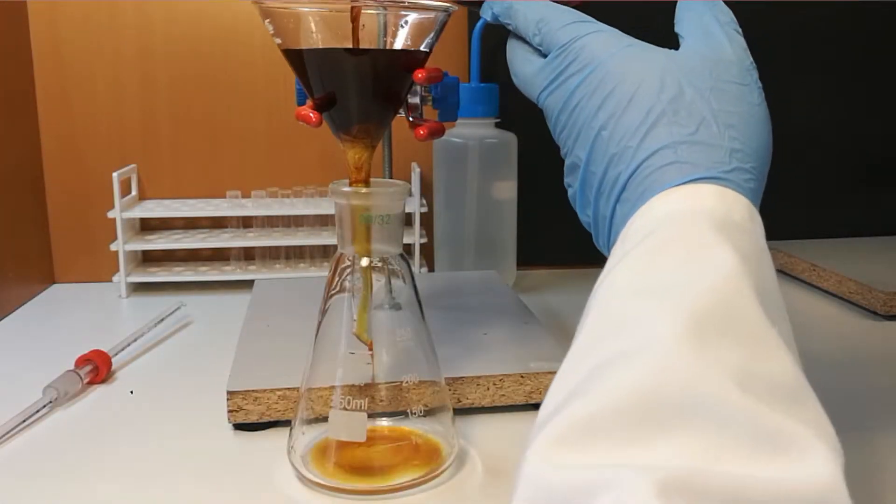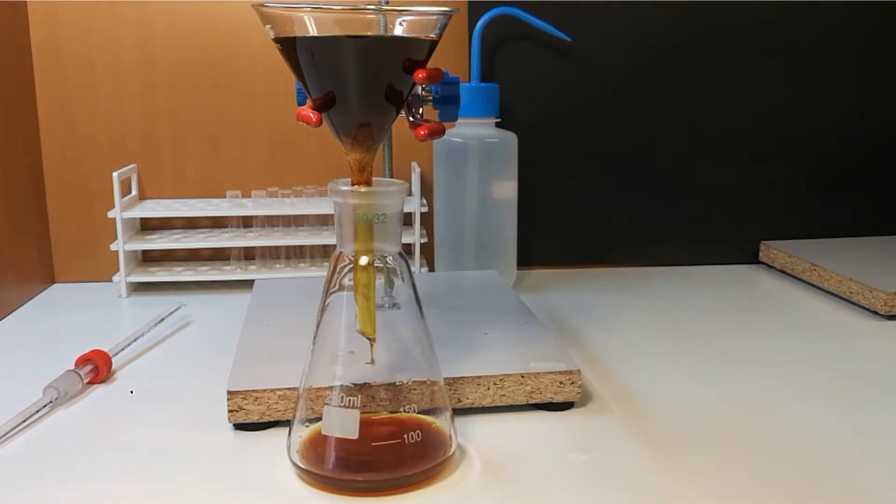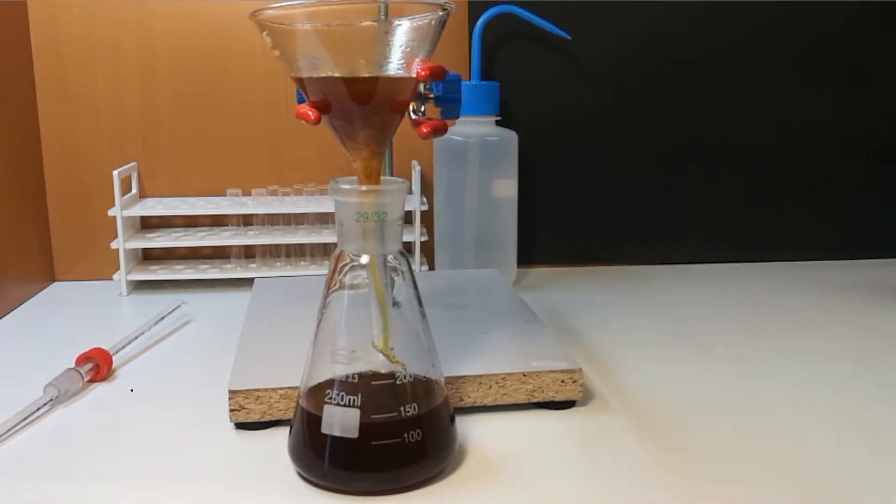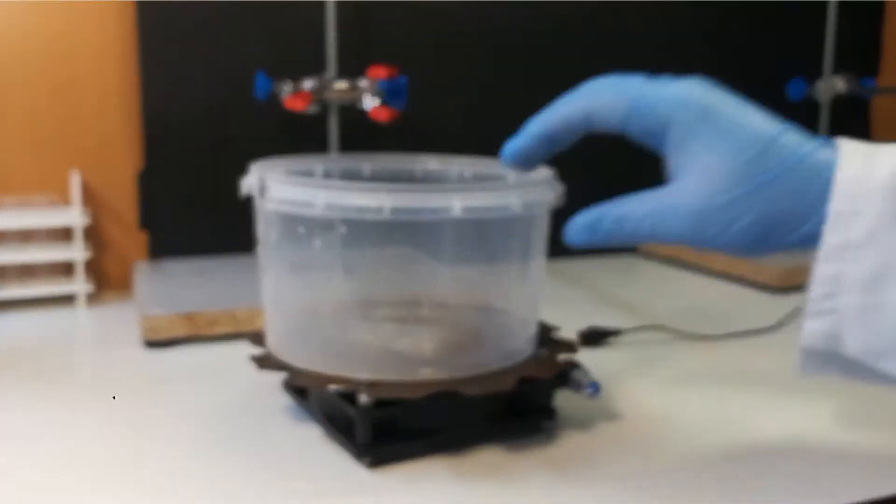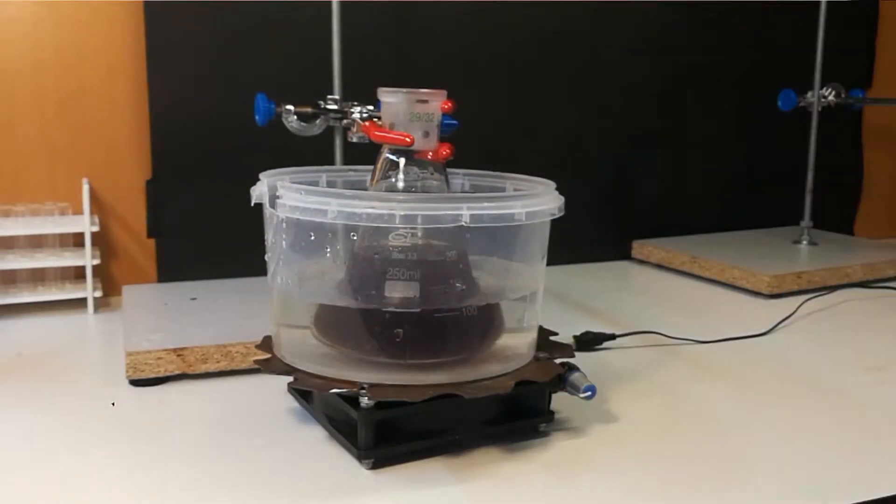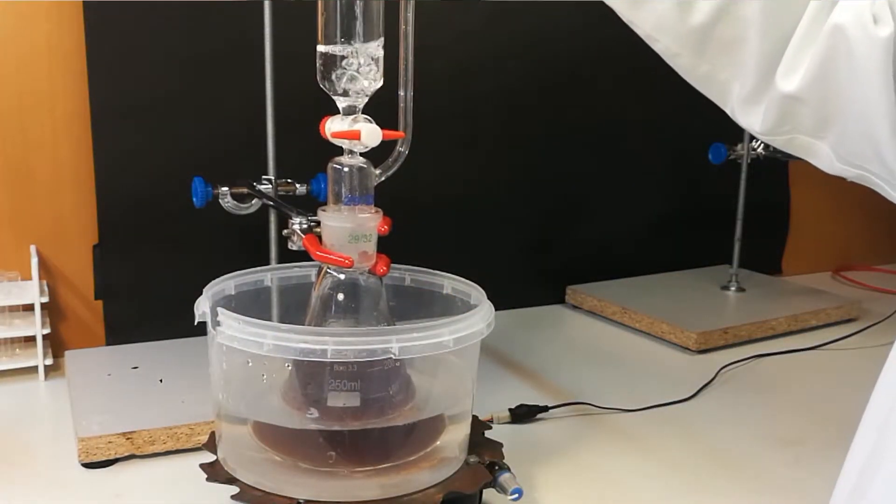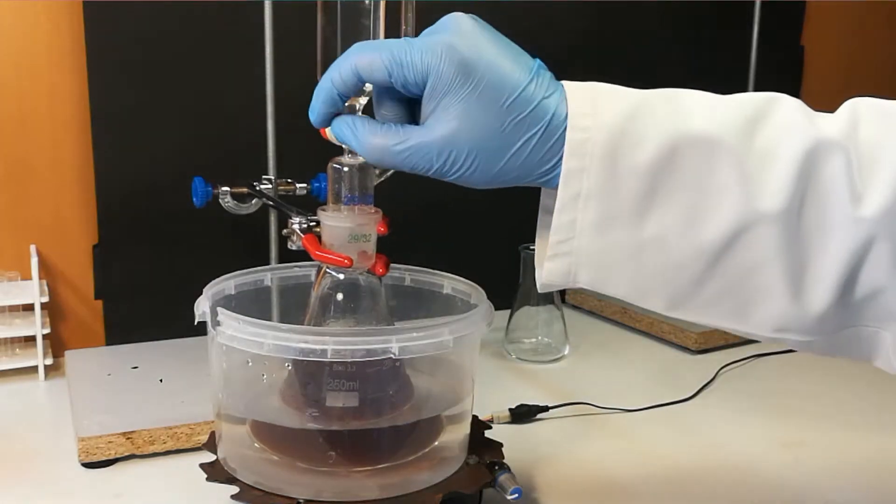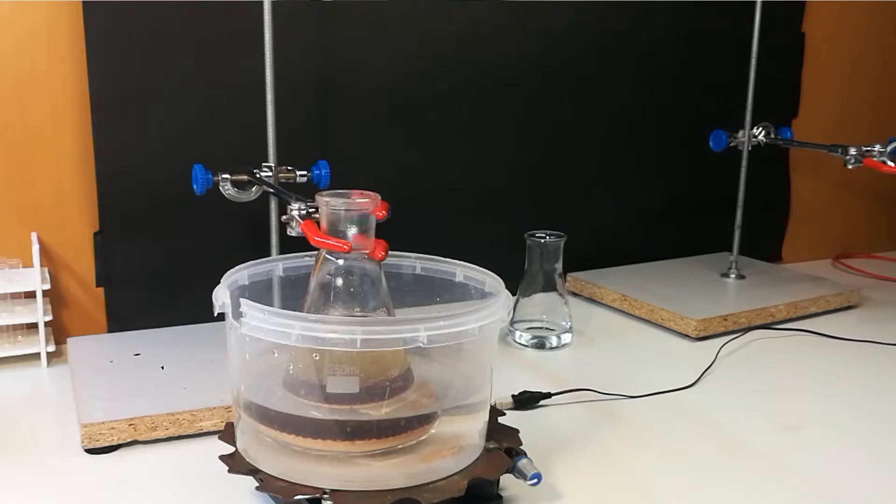Filter reaction mixture through cotton filter. Prepare cooling bath and add acid solution you made before to funnel. Drip in until pH is around 5.